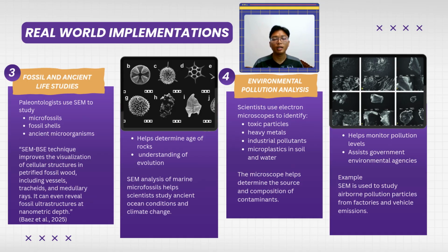In conclusion, SEM plays an important role in geology and earth science because it allows scientists to analyze materials in extremely fine detail. Okay, thank you.